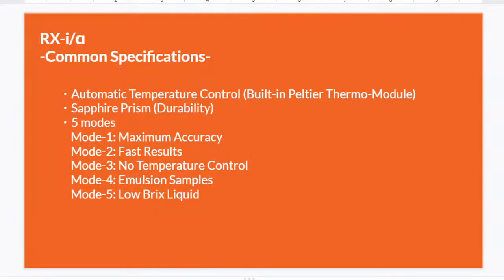Here are some common specifications of RxI and Rxα. They both have automatic temperature control, which means a built-in Peltier thermal module. Our PAL or MASTER had automatic temperature compensation, which compensates the temperature and reads the value as if the temperature is 20°C — it adjusts the values, not the temperature. But the Rx series can actually control the temperature. So that is the difference between automatic temperature compensation and automatic temperature control.